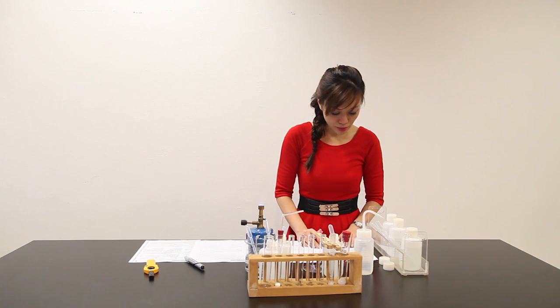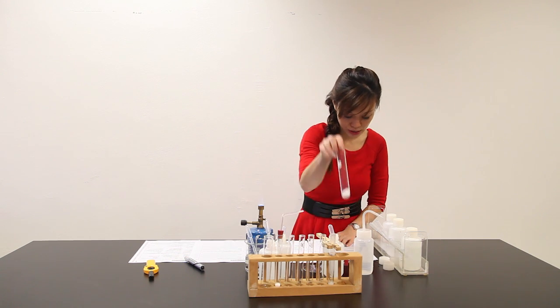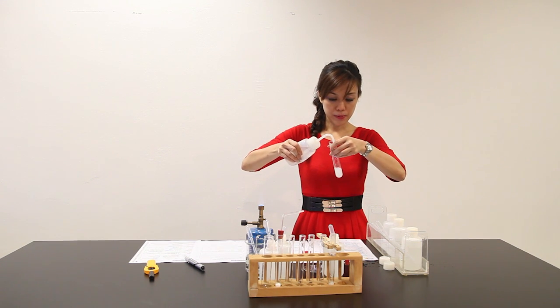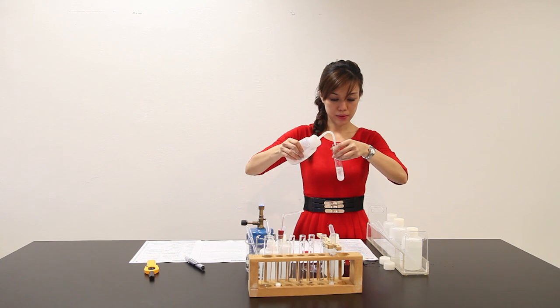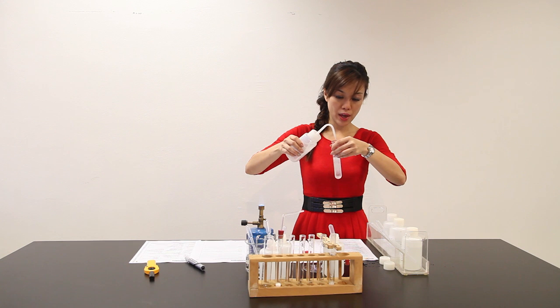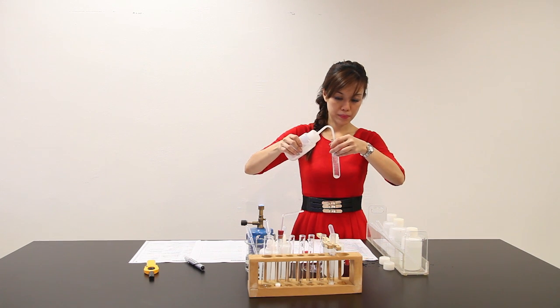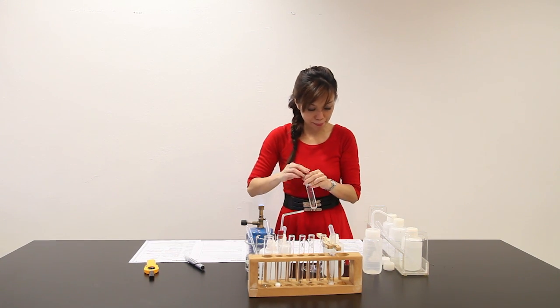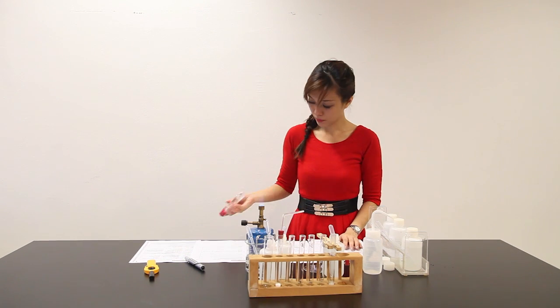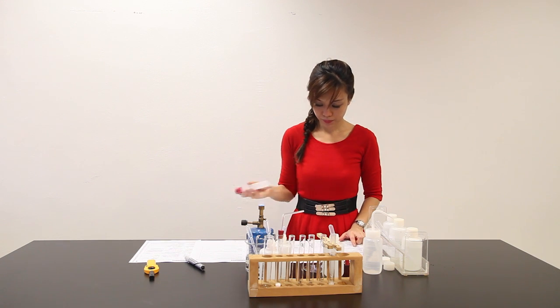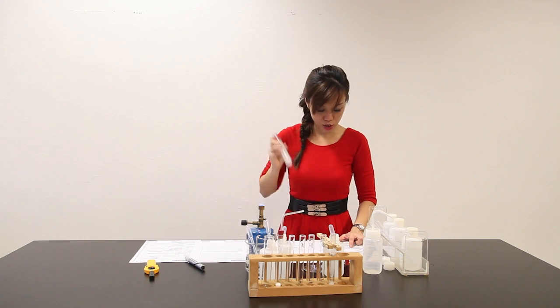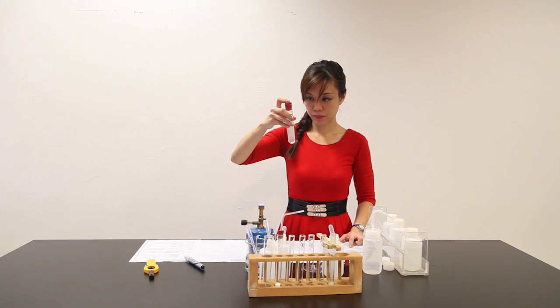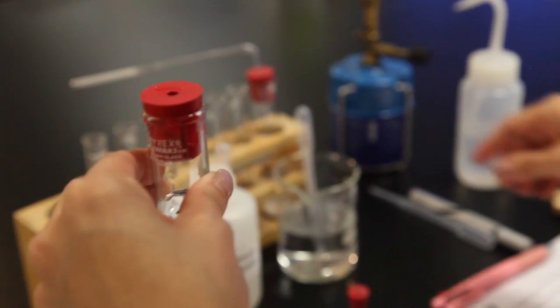Let's move on to the second part. Remove the stopper from the large stopper test tube labeled salt cube, which is this one. Add about 10 cm³ of deionized water, which is distilled water. I just need to fill everything up with the distilled water. This will be my sample solution cube. Making sure everything dissolves, shake the mixture.